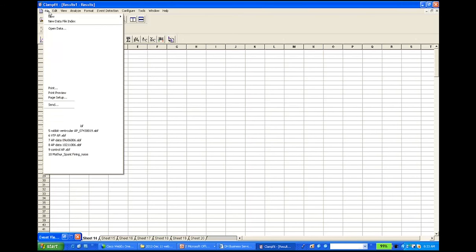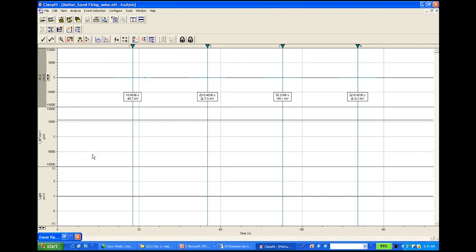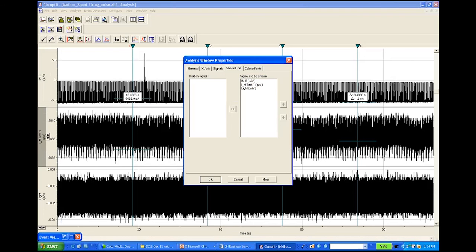Now, the next experiment I want to do is how we can reject unwanted noise or events, to do some unwanted event rejection. Let me bring out this one. Let me redo it again. Click here, and if I don't want to see these two column panels, I want to hide them, go to here.